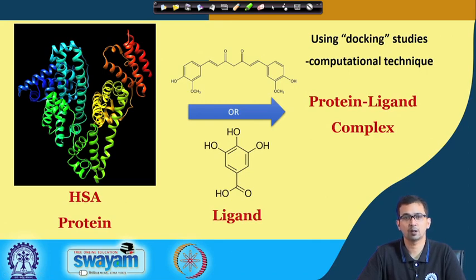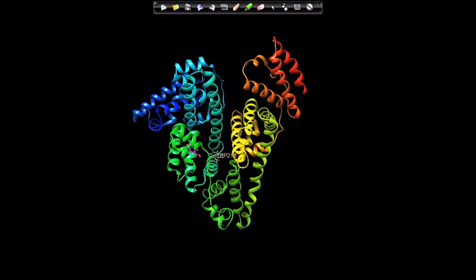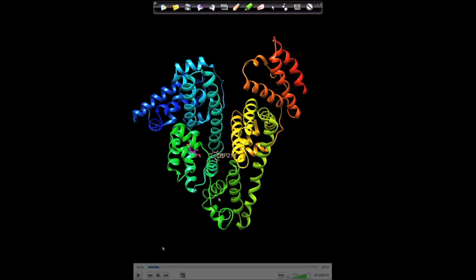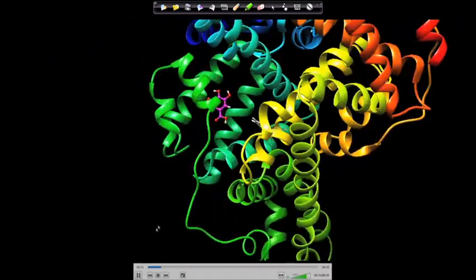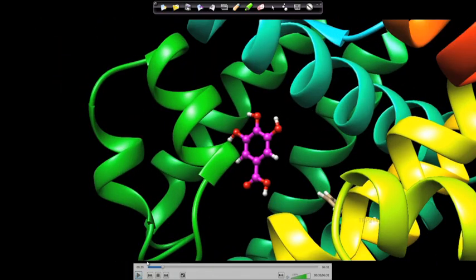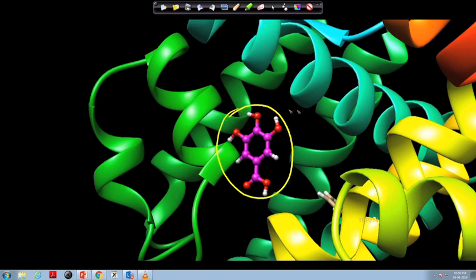Docking studies: many of you may have heard of these or may not be familiar. Docking studies take into account the protein structure and place one of the ligands — either curcumin or gallic acid — onto the protein, giving the structure of the protein-ligand complex. Now we will see how this protein-ligand complex looks. Playing a small movie of HSA, we can see two different molecules, and one familiar molecule is gallic acid.